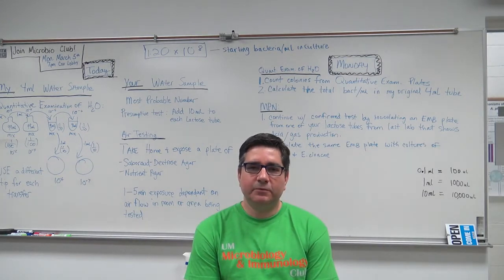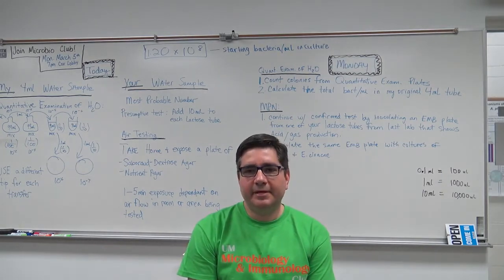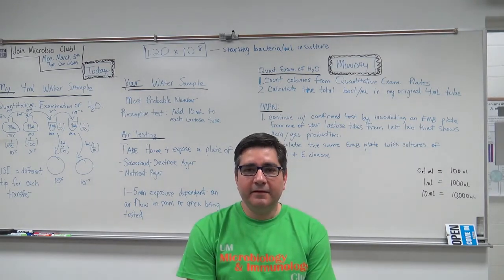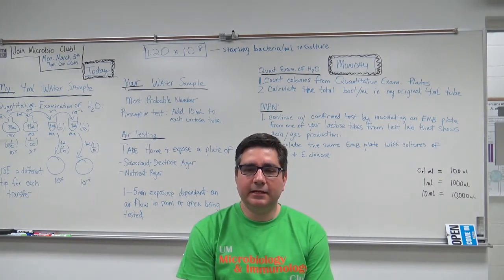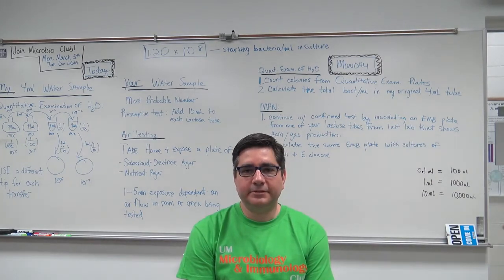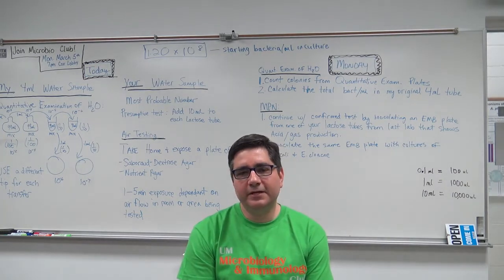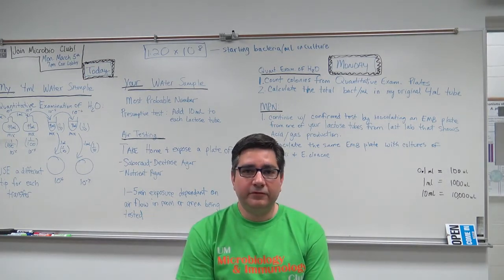The next technique we'll discuss is the membrane filter technique. The membrane filter technique was created to be an alternative to the MPN. Benefits to using this technique over the MPN is that this technique allows you to isolate colonies of coliforms and other microorganisms. It also allows you to then obtain those colonies for study, as well as allowing you to test a much larger sample of water. This technique will be demonstrated to you in video number 17, membrane filter technique.